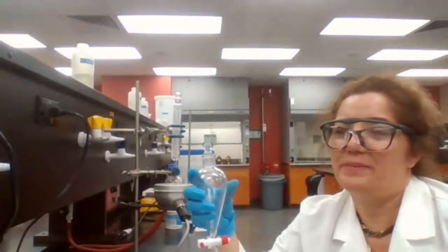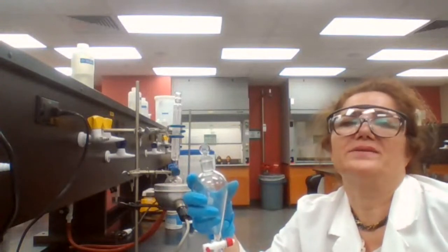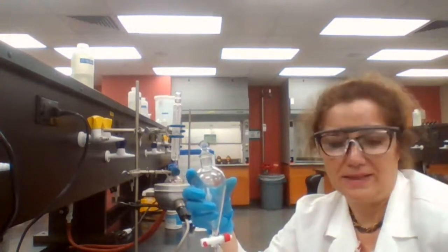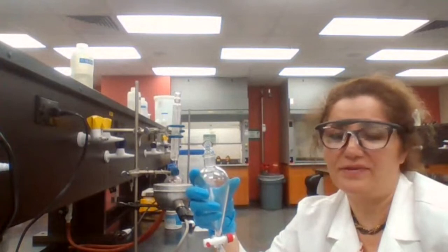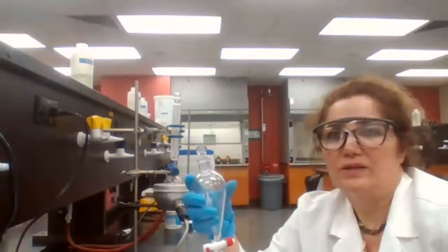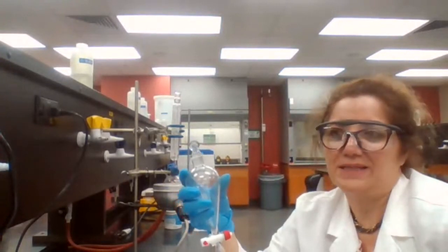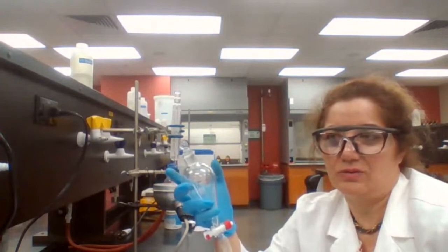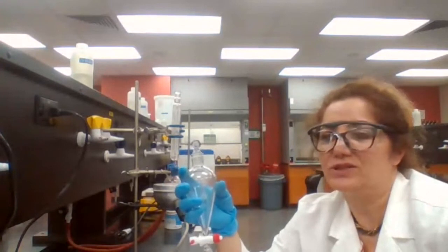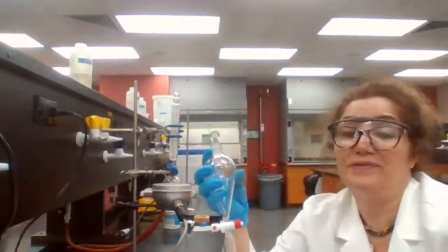Benzoic acid, how many carbons do you have for benzoic acid? Seven carbons, right? If you have seven carbons for benzoic acid, anything more than five carbons is not going to dissolve in water. So benzoic acid is going to dissolve in hot water, but not cold water. Benzoic acid stays in the organic layer also. How would you separate the benzoic acid in this reaction? How would you remove the excess benzoic acid, if any is left over?